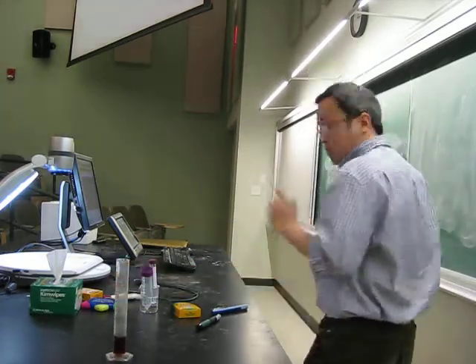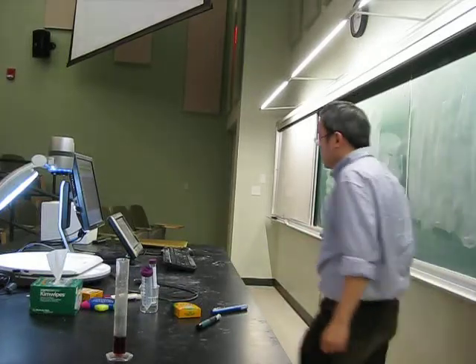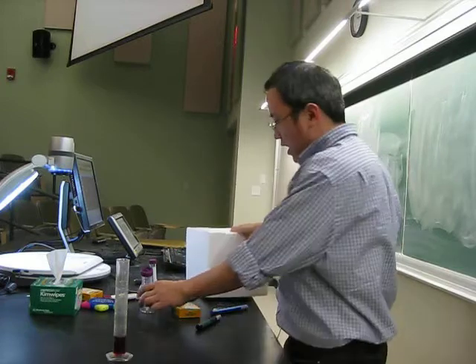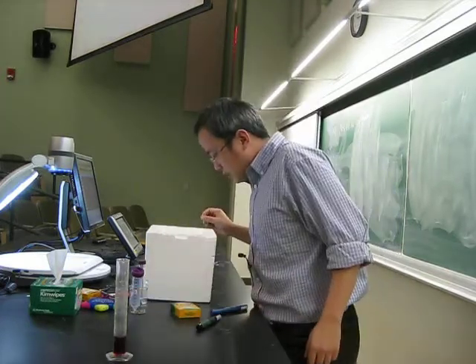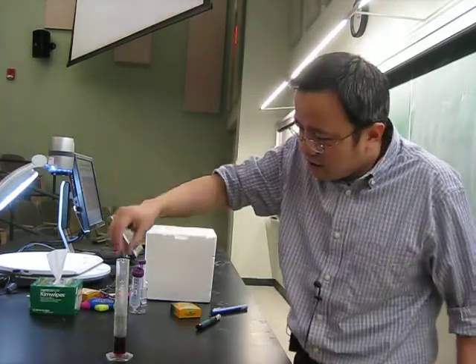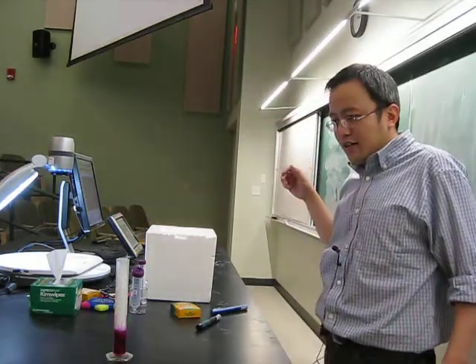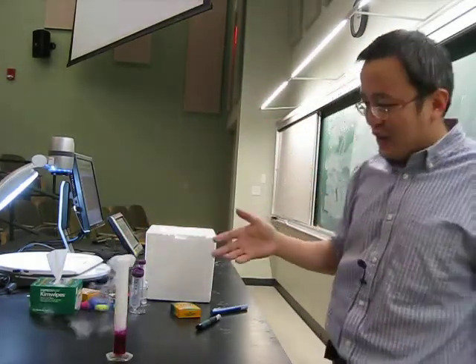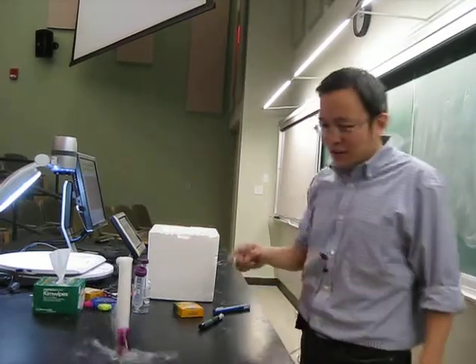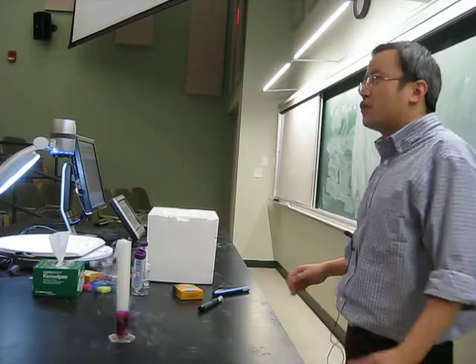The second step is I want to put in some of the dry ice. Okay, very cold. Let me see if I can just drop it. Oh, you look at this fantastic bubble coming out, right? Okay, and then it's kind of bubbling. What is dry ice? Question.